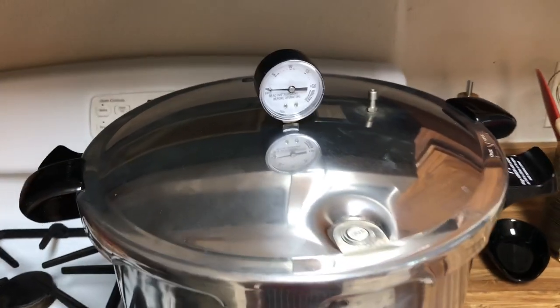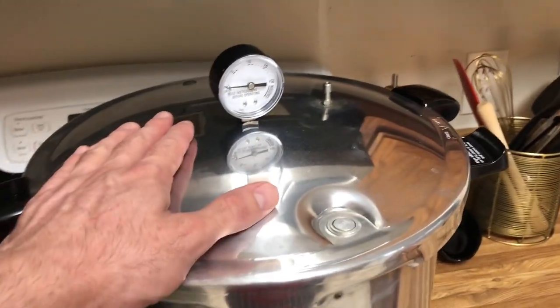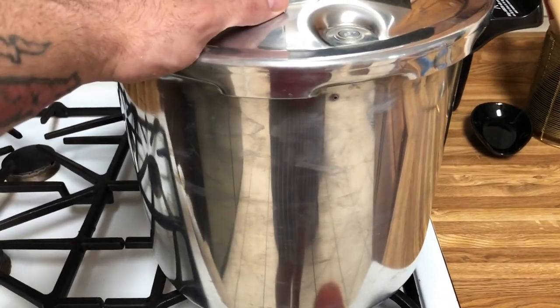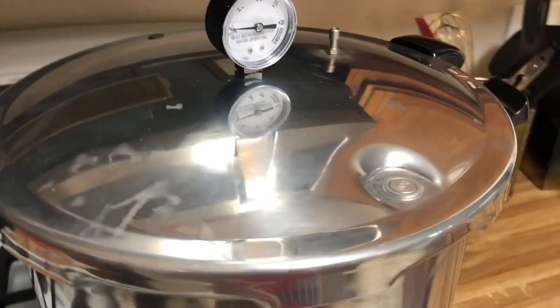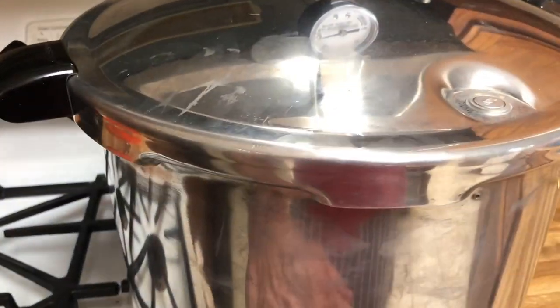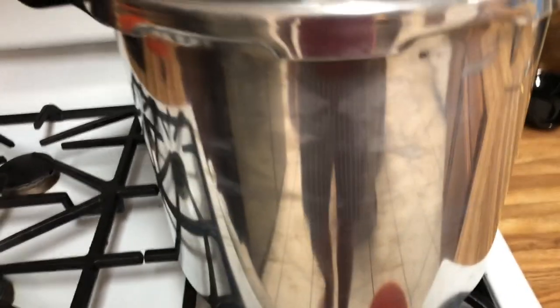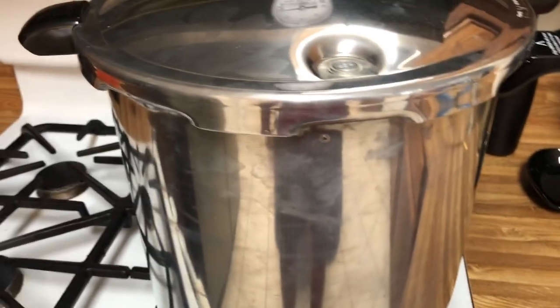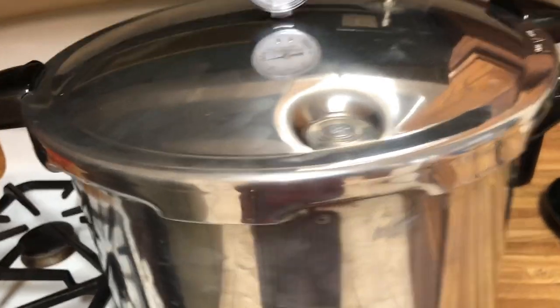Let's talk about the pressure cooker for a minute. Pretty simple. This isn't a pressure cooker video, so I'm not gonna go into detail, but essentially you're gonna load your jars in. Then when you fill it up with water, they're gonna be about halfway up the jars. That way you don't lose too much water while you're pressure cooking. And other than that, you should pretty much know how to run your pressure cooker.